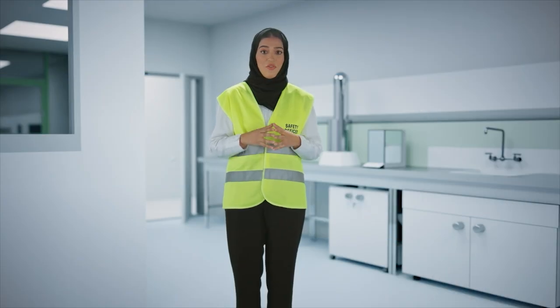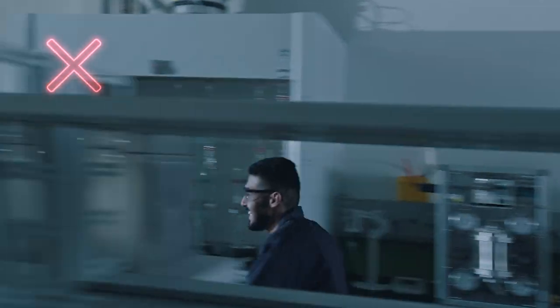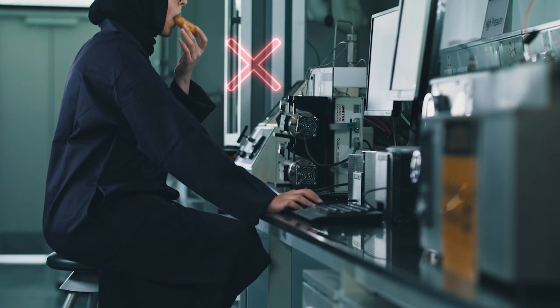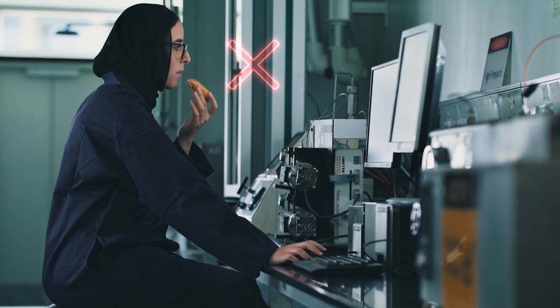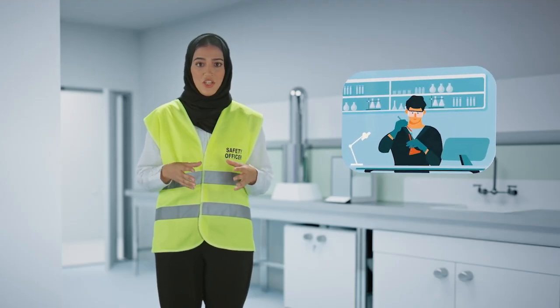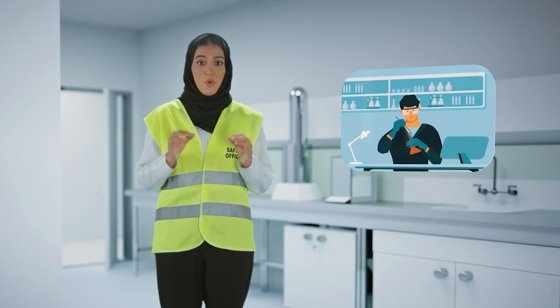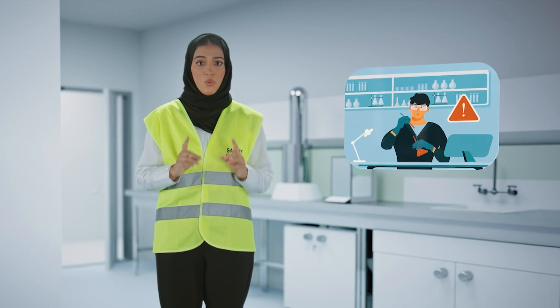The laboratory can offer diverse opportunities for learning, but while working in the laboratory, you should remain alert to your actions and the actions of those around you. No horseplay will be tolerated. Never consume and/or store food or beverages or apply cosmetics in the laboratory. Variations in procedure, including changes in the chemicals to be used or in the amounts that will be used, may be dangerous. Alterations should be made only with the approval of your instructor.